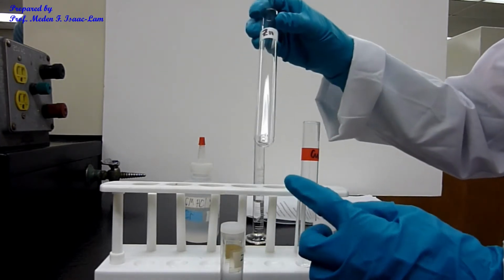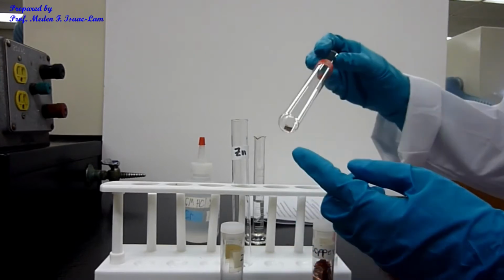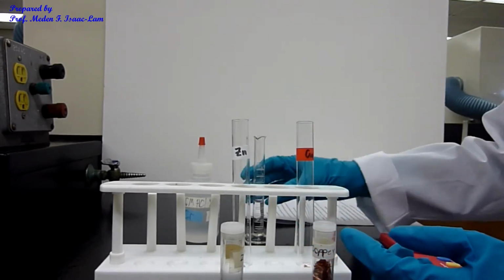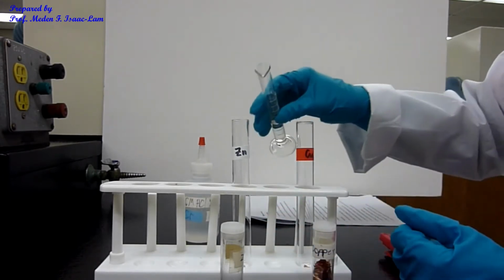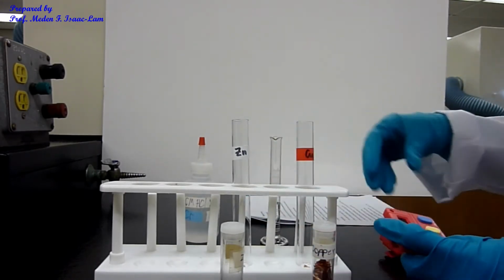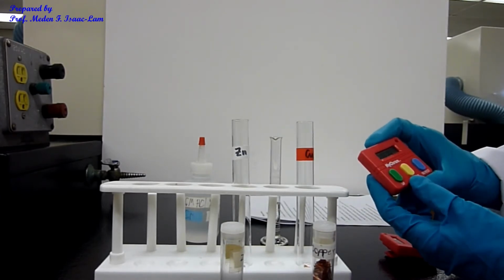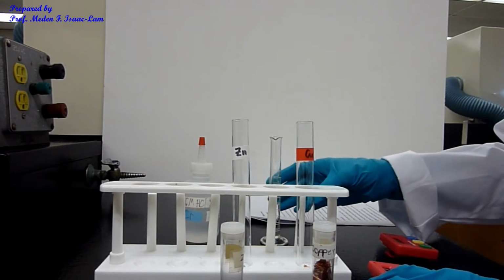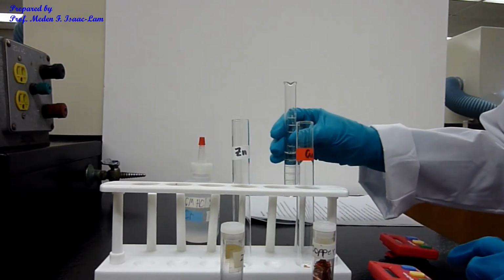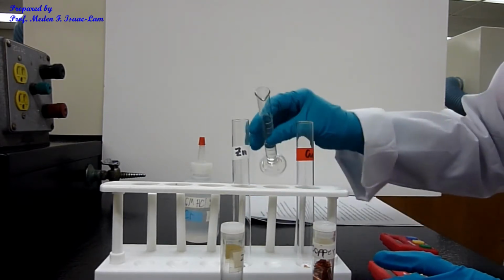So I put zinc at the bottom, and then the copper strip, and then this is the 6 molar hydrochloric acid. I'm going to time it. I will have the timer on, and once I put the 6 molar hydrochloric acid, I will start timing.